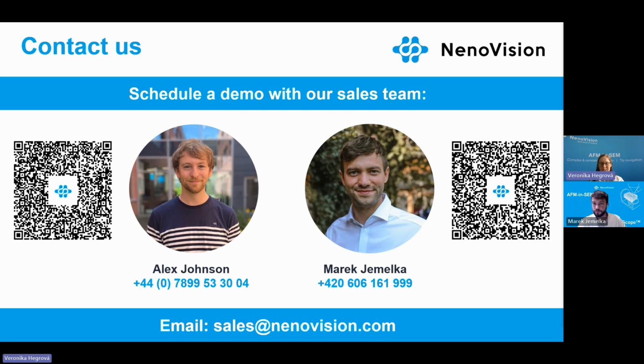Thank you for your question. Again, it depends a lot on the sample and tip used. For the conductive AFM that we've done on these applications I showed in the webinar, there can be a dozen samples or a dozen scans. Our scans, I believe, we did up to the 20 micrometer range.